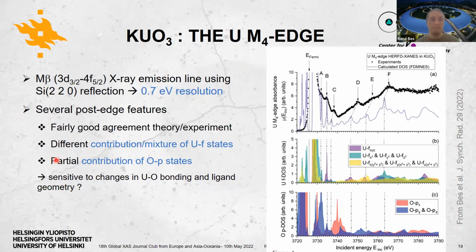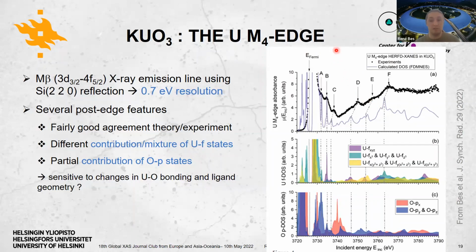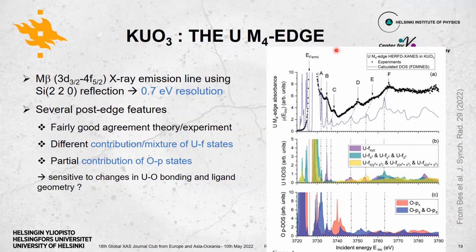The thing is that even when you know the right lattice parameters, as much as you can know them perfectly, I found that in uranium calculations using HERFD-XAS, there was always a non-linear shift behavior on the high energy side. On many uranium compounds I calculated. So maybe it is related, I suppose, to DFT effects or something. Okay, yeah, I see.